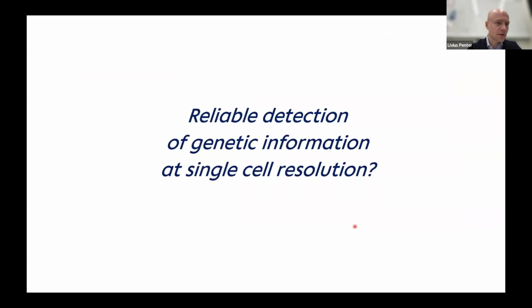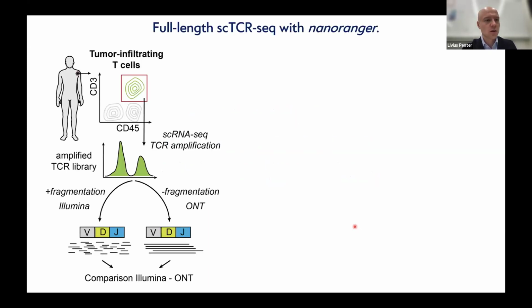Anyone who knows something about Oxford Nanopore sequencing is going to be surprised, and they're going to ask, okay, does this really work? I remember that Oxford Nanopore sequencing doesn't have a great sequencing accuracy. Can you convince me that this actually works? So I want to give you an example that hopefully will convince you that this can work.